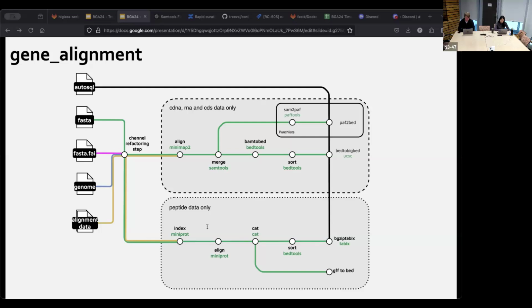So because they found that the protein alignments are actually helpful for making accurate corrections. For these, we use miniprot, built specifically for protein sequence alignment. So just like the nucleotide sequence alignment, we split the protein FASTA file into smaller chunks to speed up the process. Miniprot, sorry, I forgot to mention the developer.